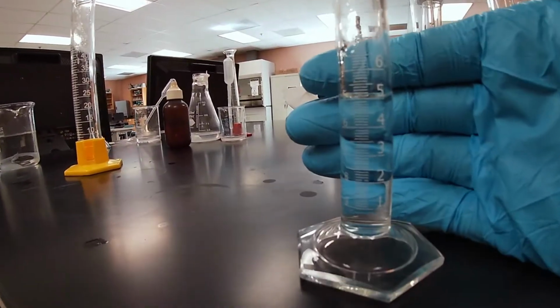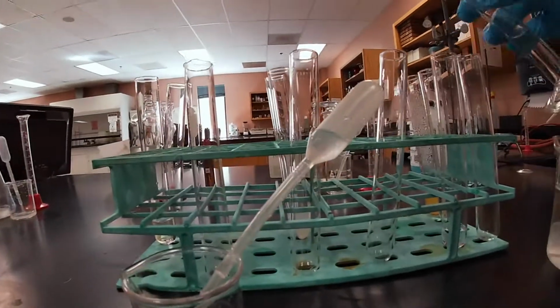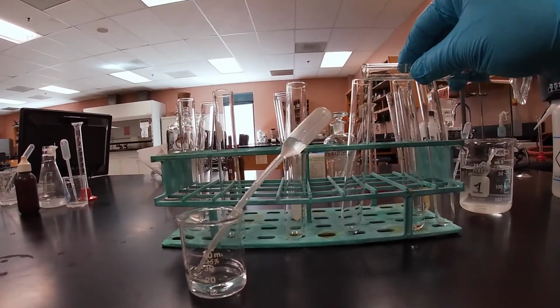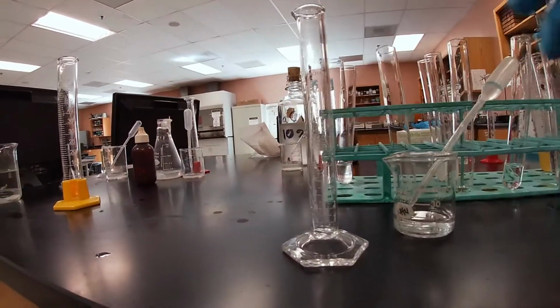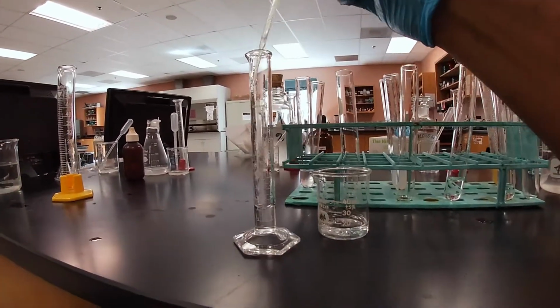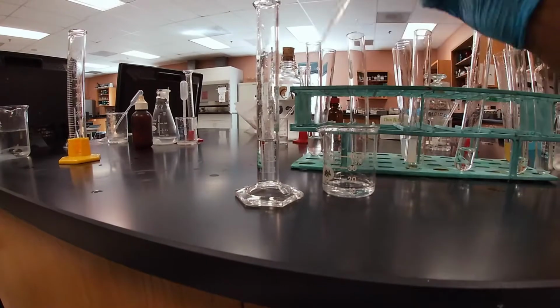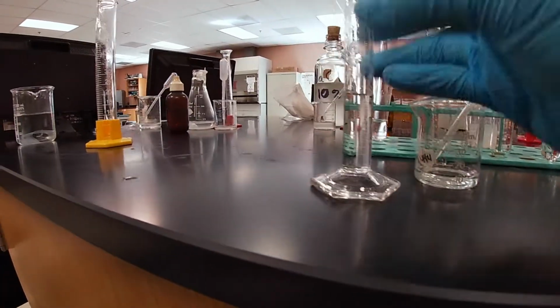Here, let me see, hopefully you can see. 5 milliliters, we're gonna put it into our first test tube. So first test tube, 5 milliliters. We're gonna get a second test tube, measure out another 5. Right on the money.